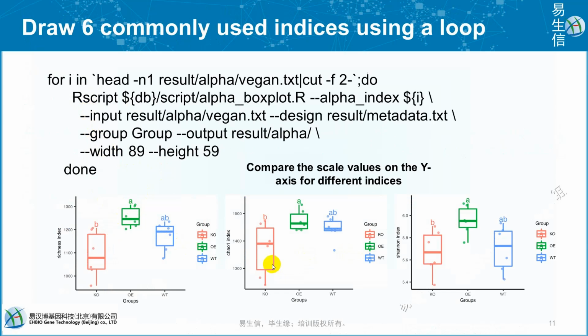You can see here that we get such a box plot. Different letters here, A and B, show statistical significance among groups, and the horizontal bar within the box represents the median. The top and bottom of the box represent the 75th and 25th percentile respectively. The upper and lower whiskers extend to data no more than 1.5 times the interquartile range from the upper and lower edge.